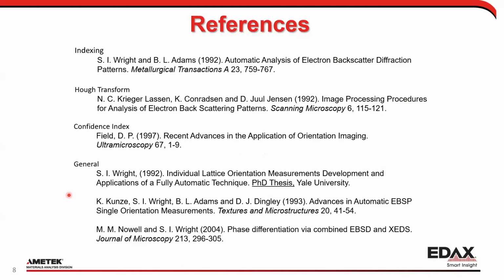So here you can see some automatic analysis of EBSD. Again, we should be very thankful for Dr. Stuart Wright, who still works with EDAX, and his PhD was basically the one that figured this out. You go down here, again, you can see there's some more about the Hough Transform. The Hough Transform is an incredible tool for basically line detection in images. There's a lot of good YouTube videos out there on the Hough Transform.